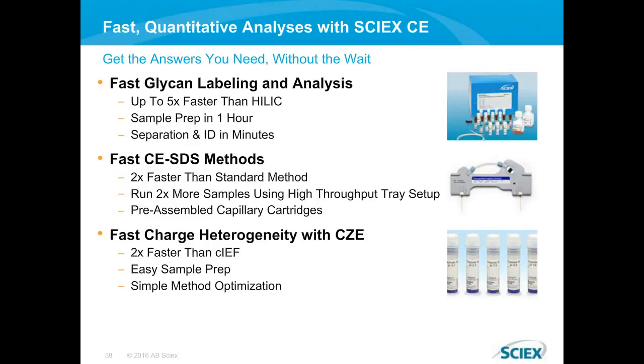Thank you. Who developed the CZE method for charge heterogeneity? So the CZE method that was discussed in the presentation was actually an effort by a number of biotech companies. Initially, some of the work was performed by Genentech and published about 10 years ago, and then refined over the last 5 years, beginning with work done by Pfizer and then by a larger group of biopharma researchers.